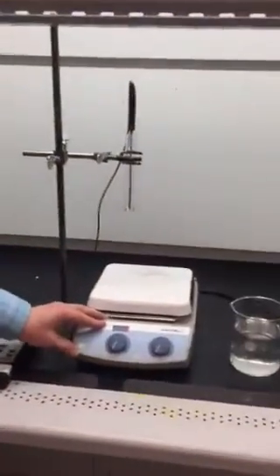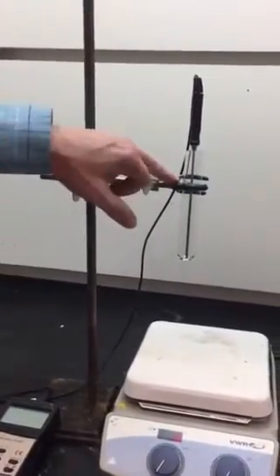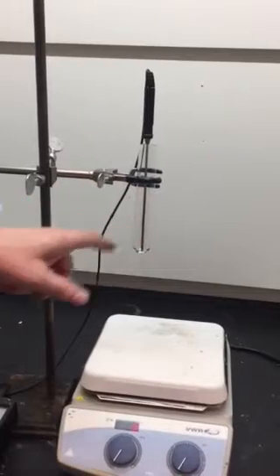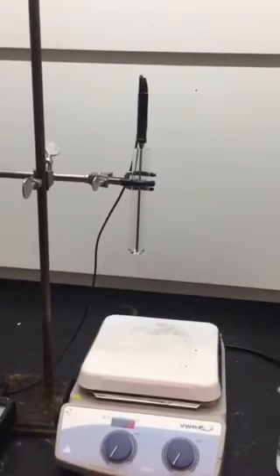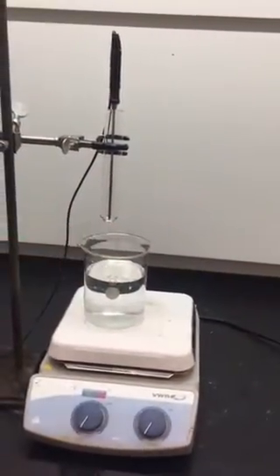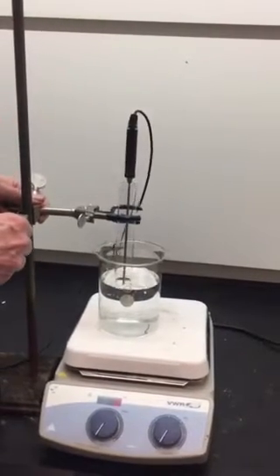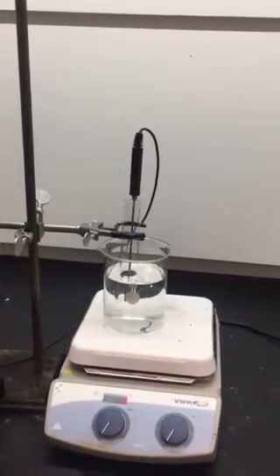Experiment one uses a hot plate here shown, a ring stand, and a special three-pronged clamp that's holding a large test tube. Some ethanol is going to go into that test tube and we're going to measure its boiling point. In order to do that we're going to take a large beaker, fill it about three-quarters full of water, put it on our hot plate, and then using our three-pronged clamp, lower our test tube of ethanol into the water.